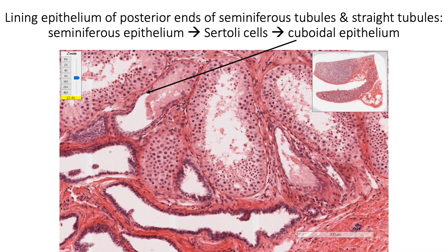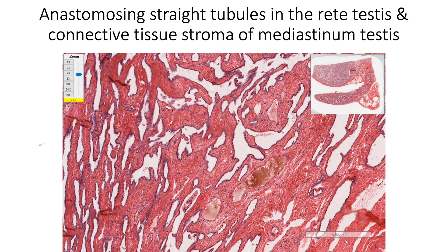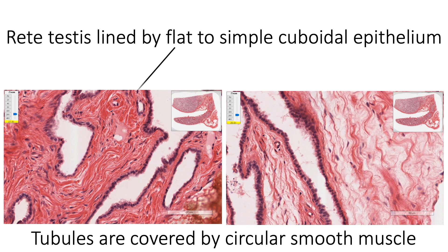The posterior part of the seminiferous tubules has fewer cell layers in the seminiferous epithelium, appearing shorter in height. As the straight tubule is approached, the tubules gradually come to be lined only by Sertoli cells, and then by simple cuboidal epithelium in the straight tubules. The rete testis shows anastomosing straight tubules in the connective tissue stroma of the mediastinum testis, lined by flat to simple cuboidal epithelium and covered by circular smooth muscle.